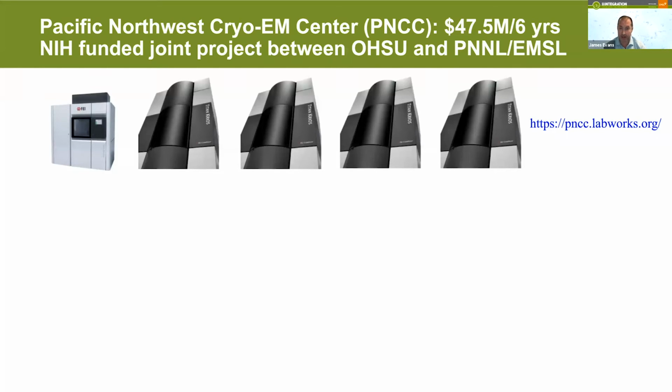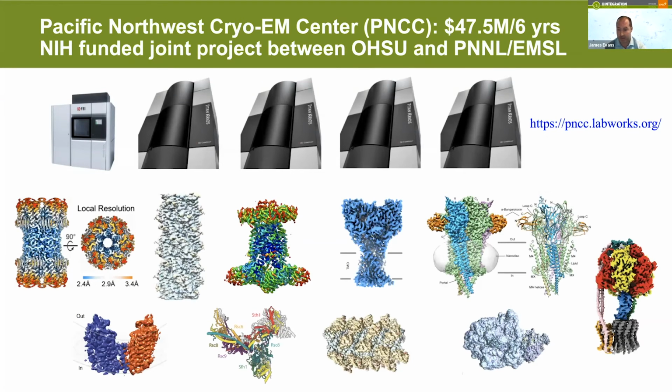The center has 5 different microscopes. Basically, the new microscope that we just brought on board here at EMSL for DOE specific work is identical to the top end line of instrument that we have at PNCC. But you can see just an example of some of the structures that have resulted from the use of PNCC in the last year. So this is also a user center that's available to us. And since we jointly operate it, I'm happy to answer any questions as well.